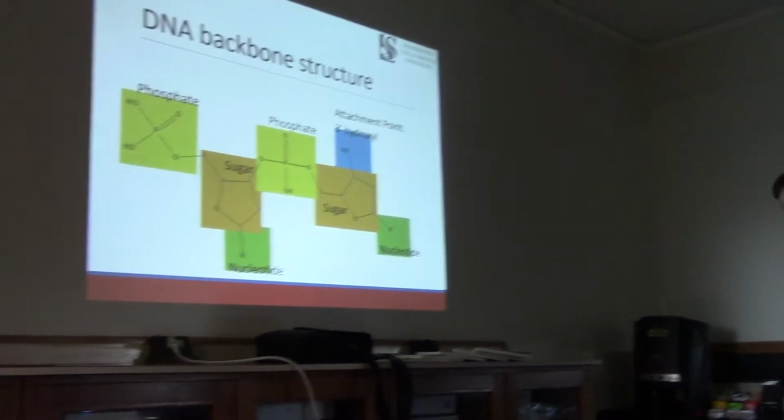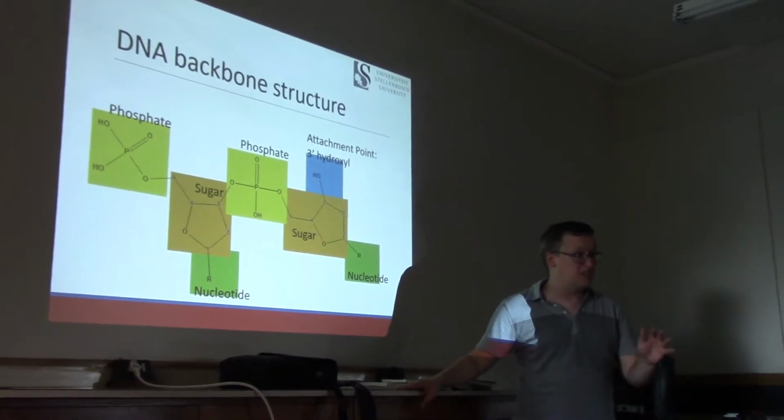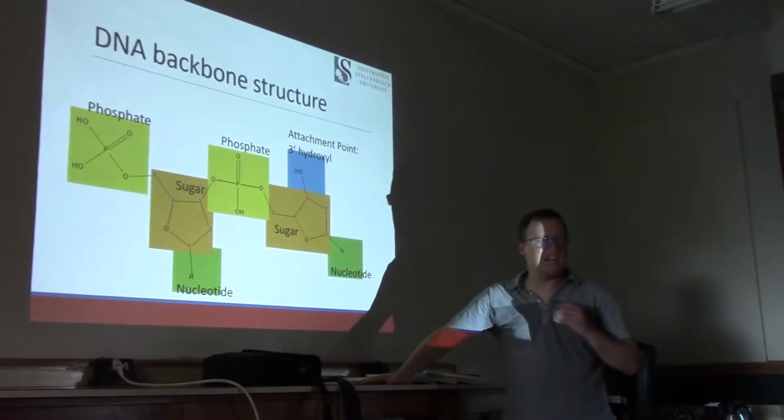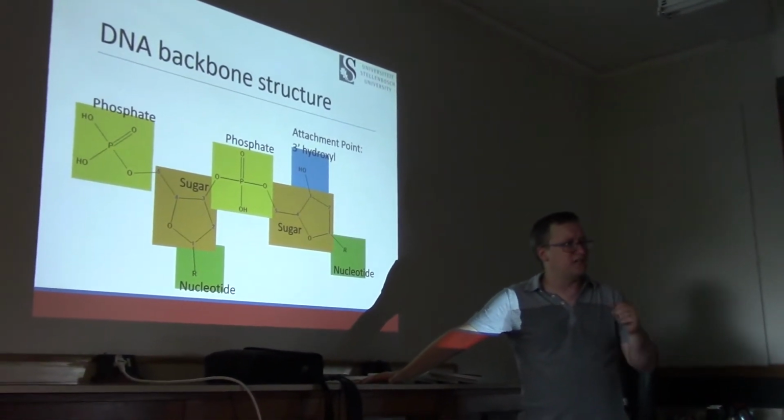I want to point out as well that some of the technologies that really dominated sequencing for forever were built around the idea that this attachment point is available for the addition of another nucleotide.